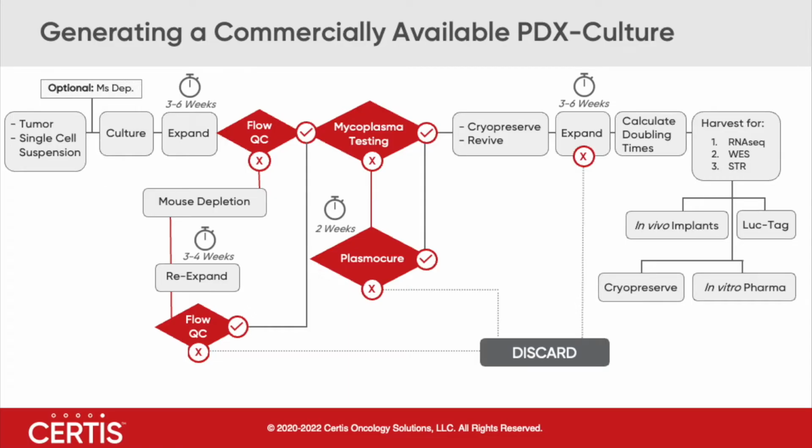We have 3 QC parameters, but one of them is for a fully developed line and the other one's sort of most basic. So number 1, mycoplasma testing. Our culture is mycoplasma free. That's the basics of any in vitro. Everyone has to do it.